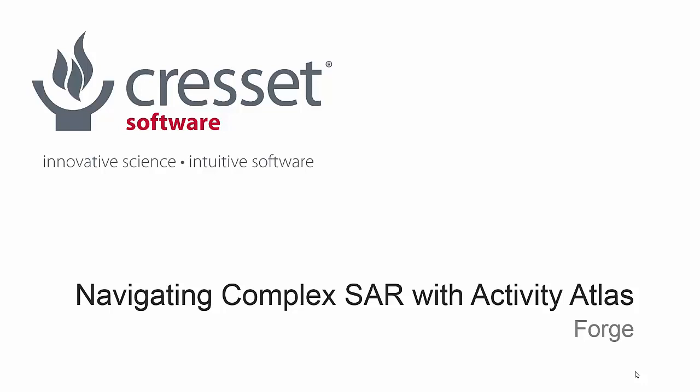Welcome to this Cresset web clip where I will introduce Activity Atlas for capturing and communicating regions of structure-activity relationship.